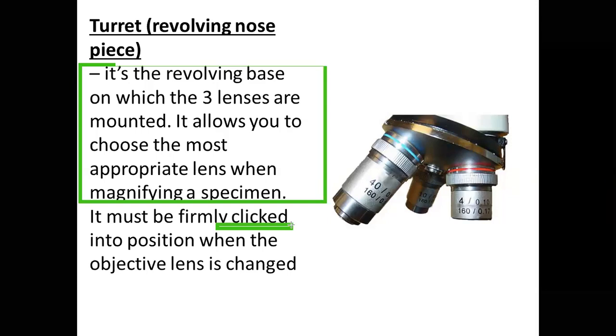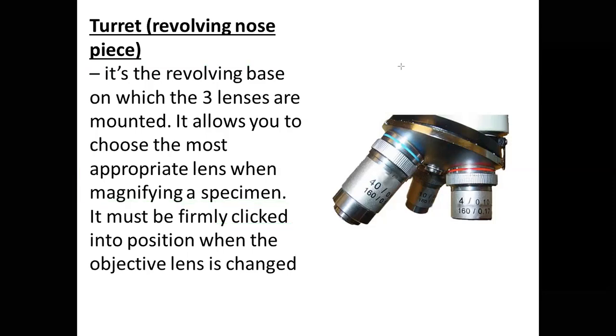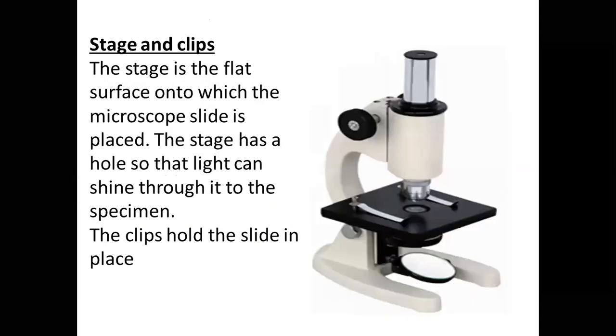And there was a question in 2015, and it's in one of our slides down there, where the examiner was so interested in how students operate this part, which we are calling the turret, the revolving nose piece. So when we get there, I'll spend more time mentioning what the examiner wanted. And anytime you see the examiner bringing a question of that nature, it is because, out of experience, we have seen students having a lot of challenge in that area.